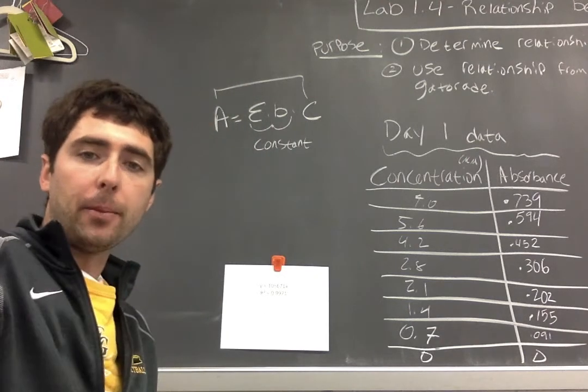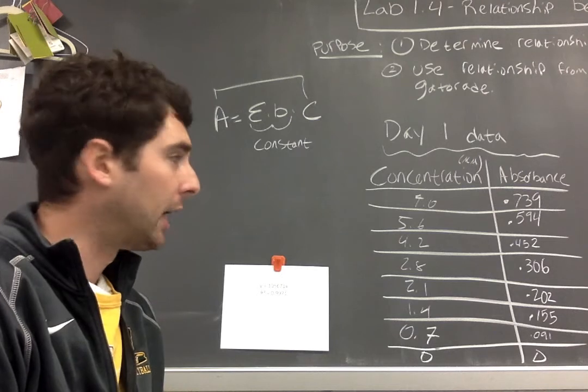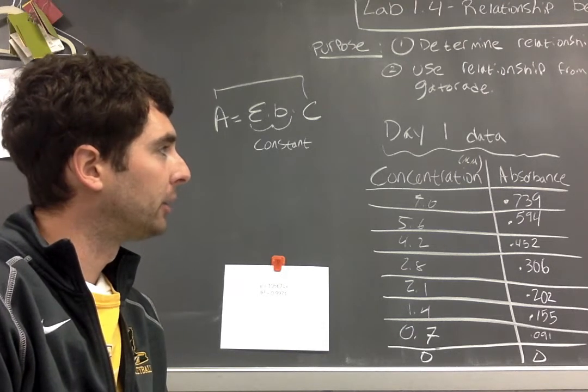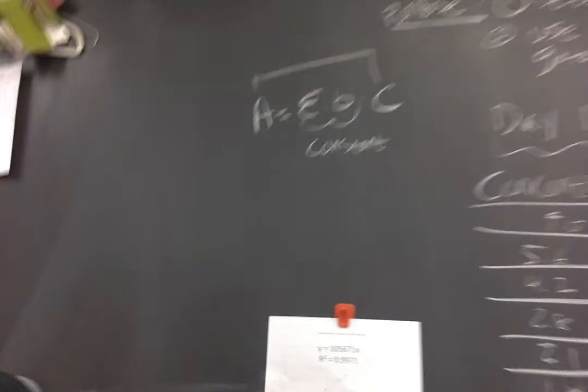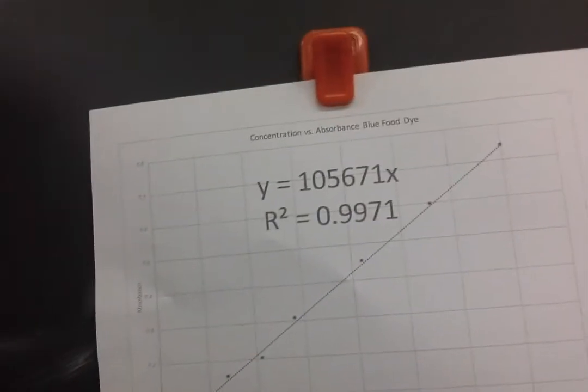What I've done in the meantime is I have graphed our data, keeping concentration as our x-axis, our independent variable, and putting absorbance, our dependent variable, on the y-axis. Here is the graph that was generated. This is also available to you on Schoology.